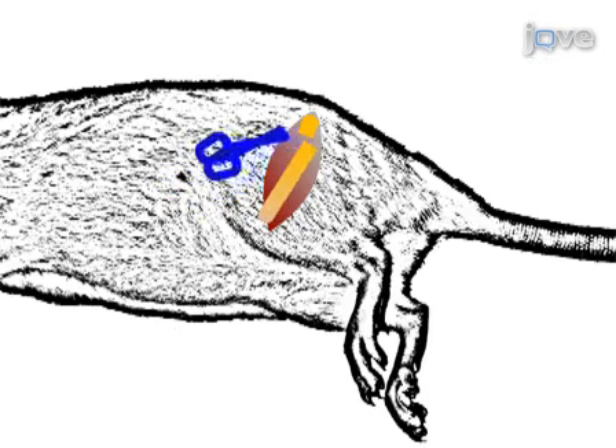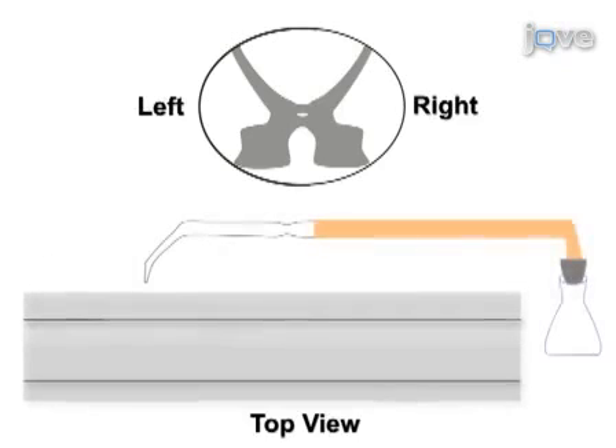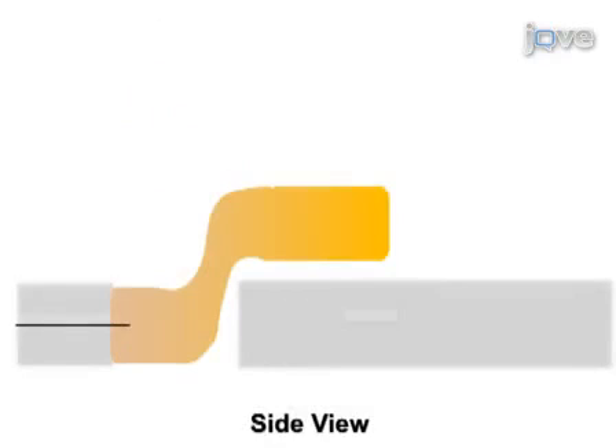The tibial nerve branch from a donor rat is transected. A cervical level 5, or C5, hemisection is made by aspiration. The PNG is removed from the donor rat, opposed to the rostral wall of the lesion cavity, and secured by suturing epineurium to the dura mater.